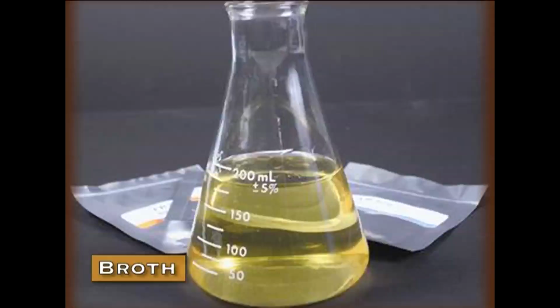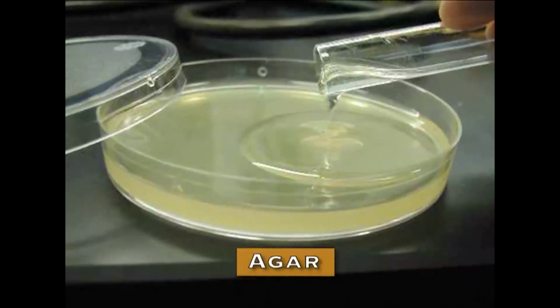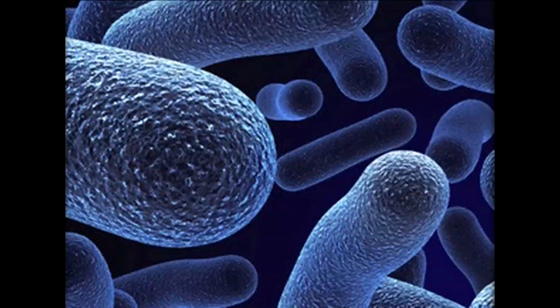How? Suppose the culture medium which we are preparing is to grow bacteria in liquid culture, which is known as broth in microbiology. The bacteria grow in it, multiply and form a bacterial suspension culture. If we grow bacteria on semi-solid medium with the help of agar, the bacteria will grow and produce discrete colonies. Now what is culture medium? Culture medium generally consists of amino acids, sugars, vitamins, minerals and other growth factors. These materials are required by the bacteria.